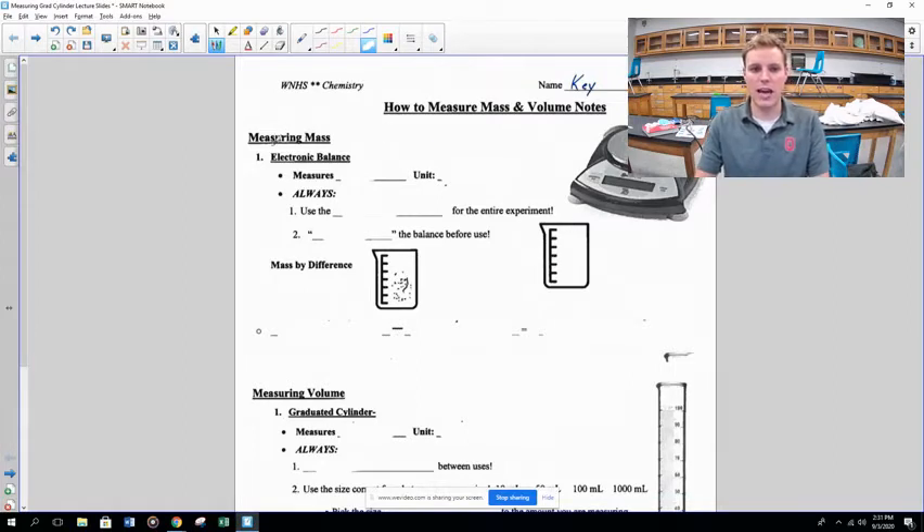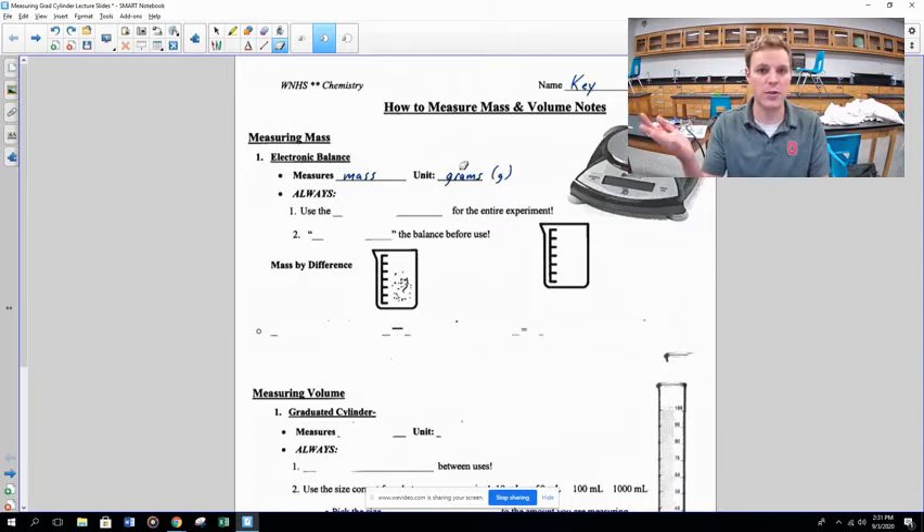The first thing we're going to look at is how to measure mass using the electronic balance. The electronic balance measures mass and the unit is grams — sometimes symbolized by the little letter G, so 50 G means 50 grams.